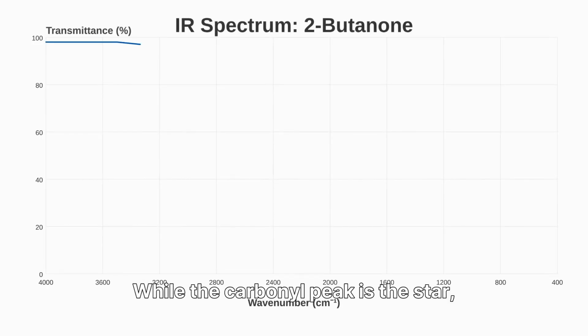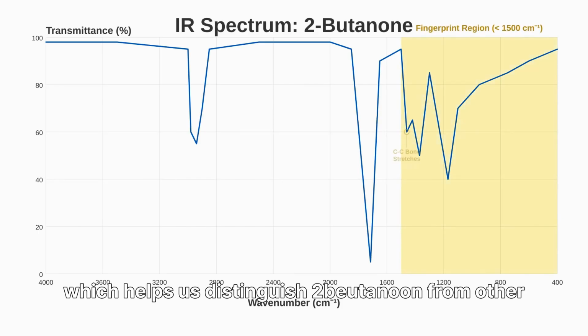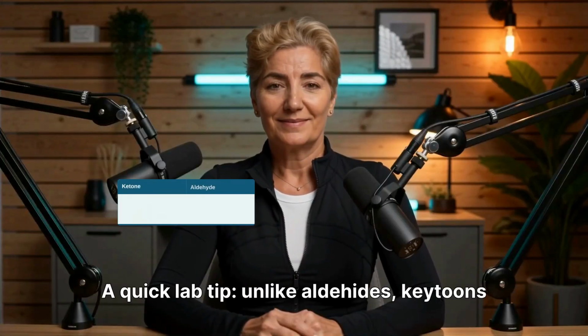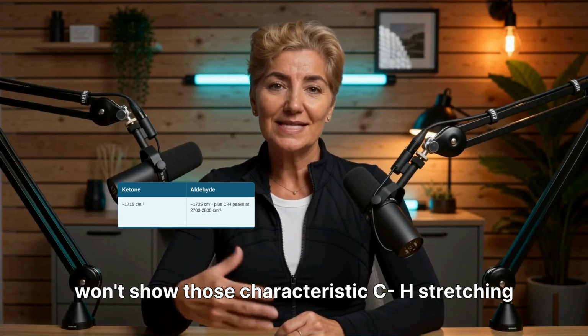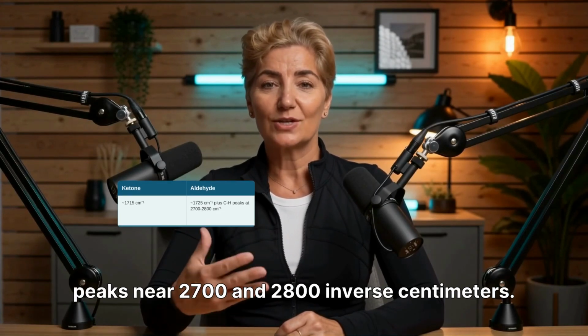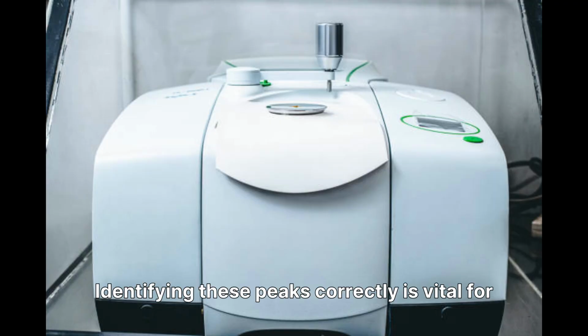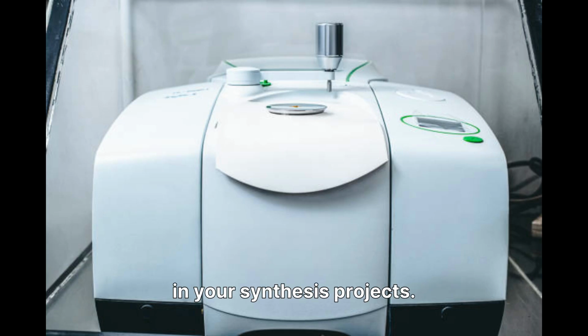While the carbonyl peak is the star, don't forget the fingerprint region below 1500, which helps us distinguish 2-butanone from other ketones. A quick lab tip. Unlike aldehydes, ketones won't show those characteristic C-H stretching peaks near 2700 and 2800 inverse centimeters. Identifying these peaks correctly is vital for determining the structure of unknown organic molecules in your synthesis projects.